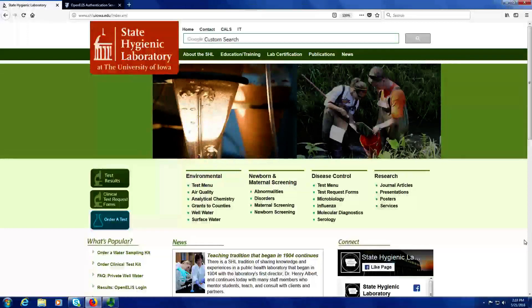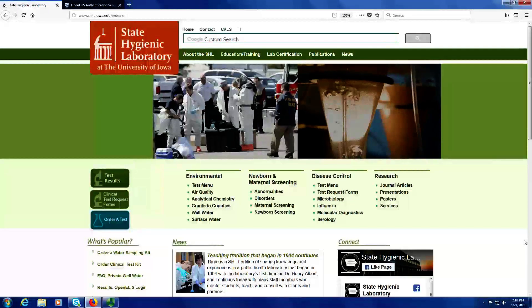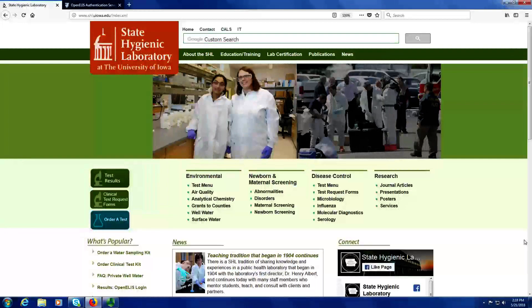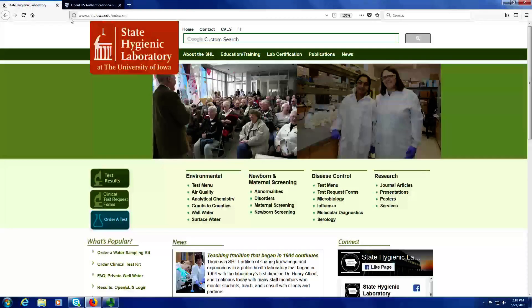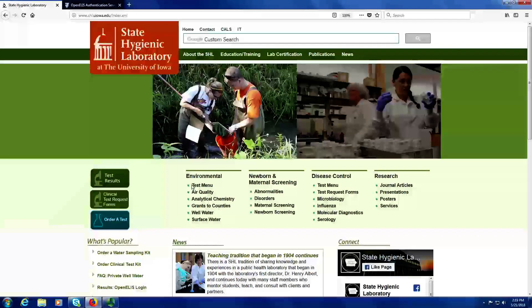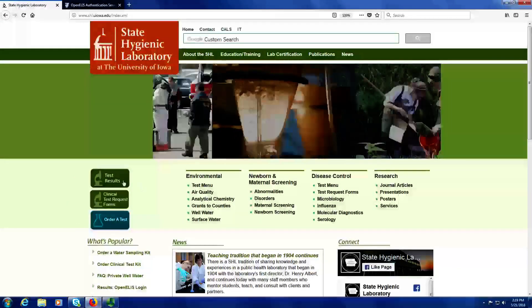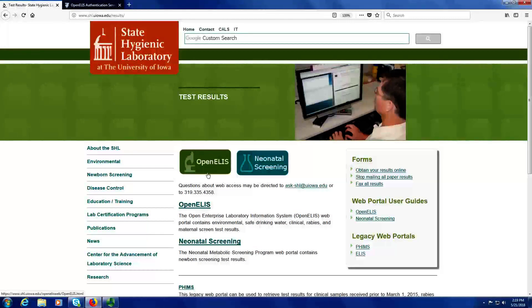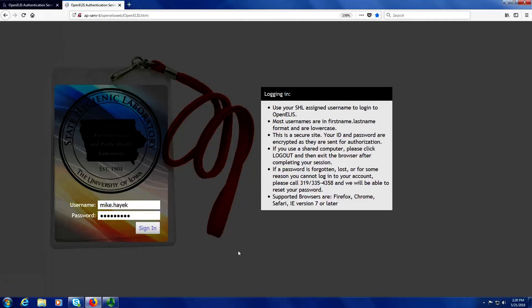This tutorial will show you how to use the OpenELIS web portal. You can get to the link of the OpenELIS web portal by going to the State Hygienic Laboratory website at www.shl.uiowa.edu. Next, you'll click on the green test results button on the left-hand side of the home page, then click on the green OpenELIS button at the top of this page. Log in with the username and password that was provided to you by the State Hygienic Laboratory.